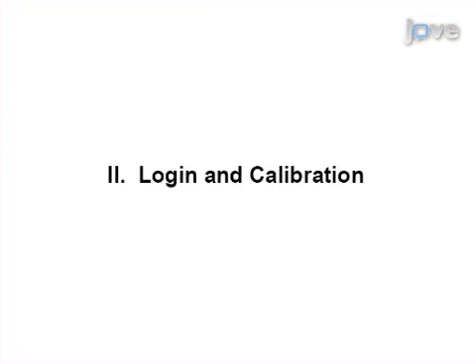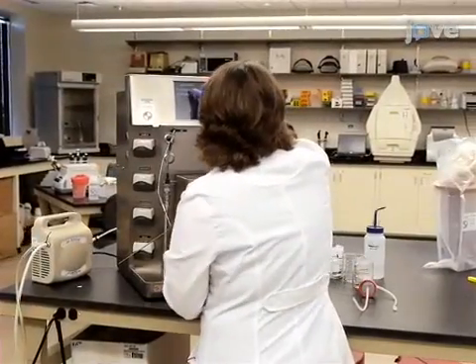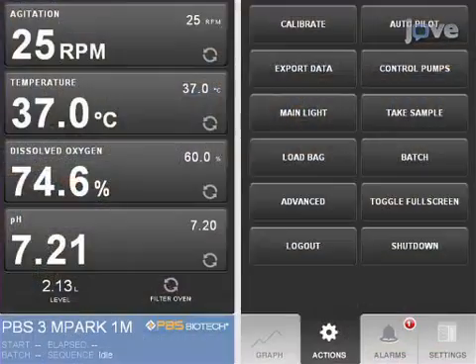Let's get started! To begin the protocol, log in into the Hello screen.